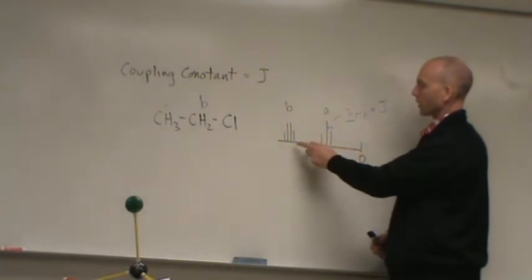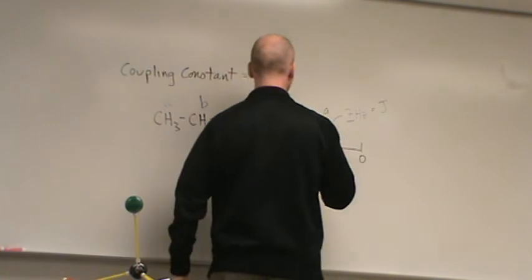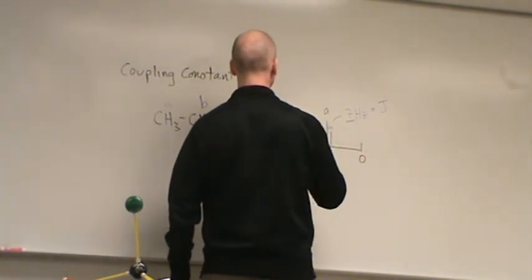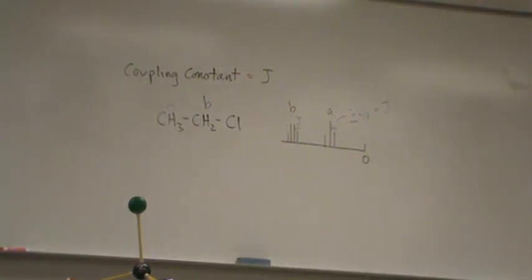If you were to measure the distance between these peaks, you would get its J value.